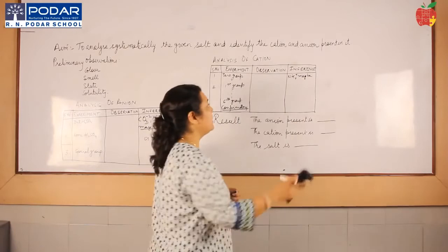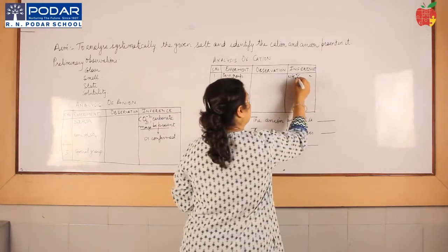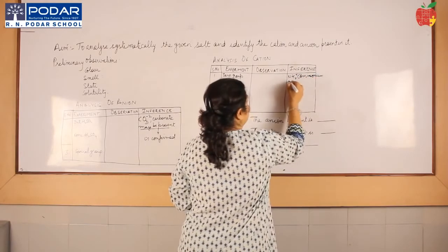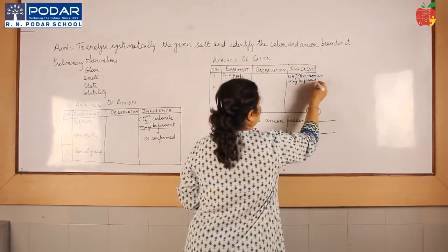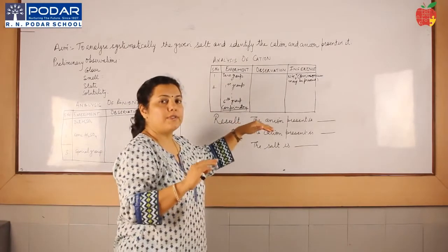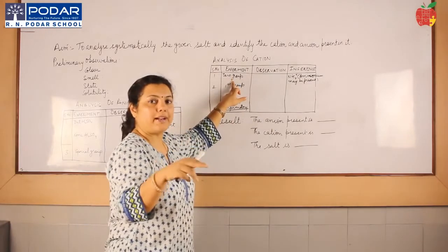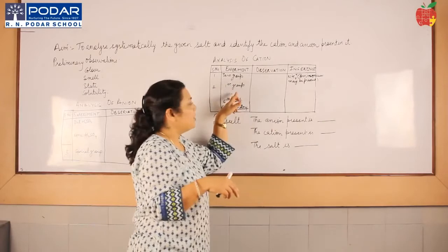You will write down the name also. Just the radical is not enough. You will mention ammonium may be present. Fine. Then when you say may be present, carry out the confirmatory test and there is no need to continue. Now suppose you don't have ammonium present, then you will say pinch of salt, add NaOH, no observation, ammonium absent. Move on to the first group now.